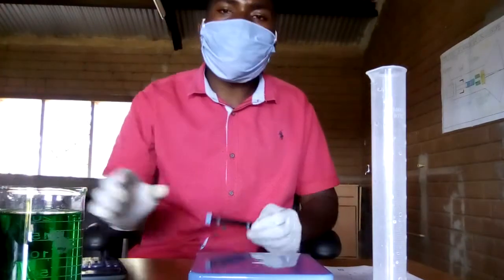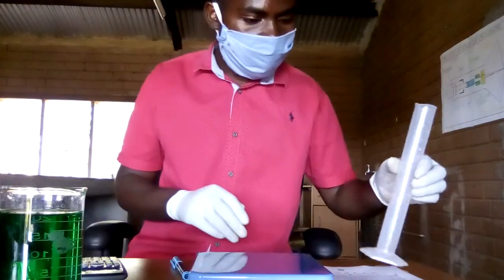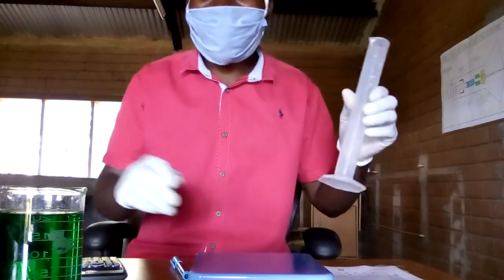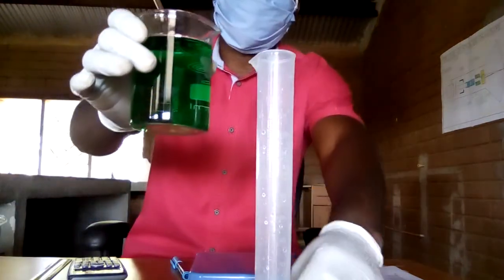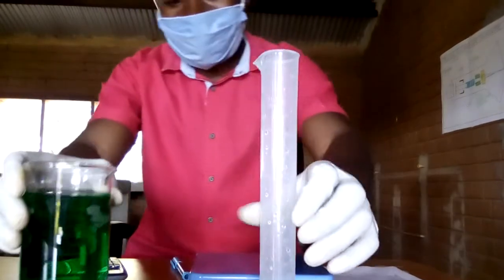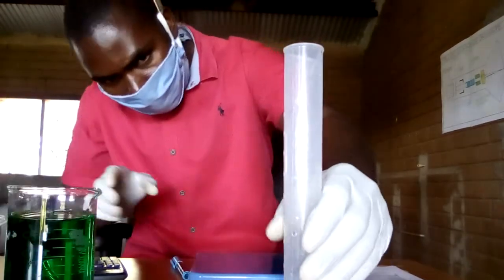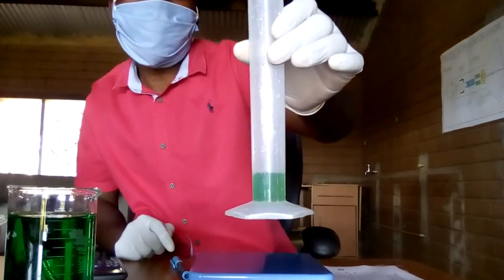Then I'm also going to measure the volume of 10 cubic centimeters of liquid P. So I'm going to pour about 10. Yes, this is the volume of 10.